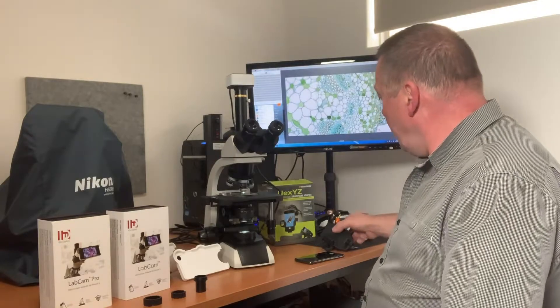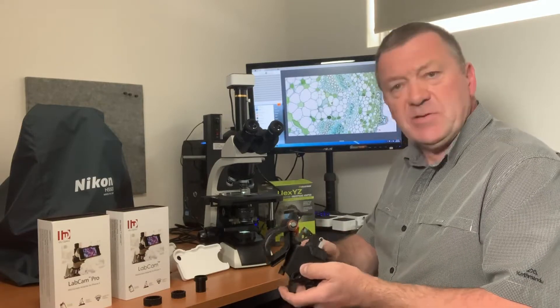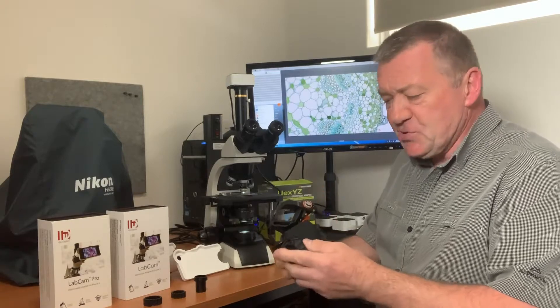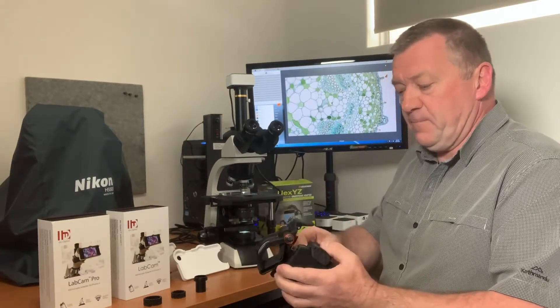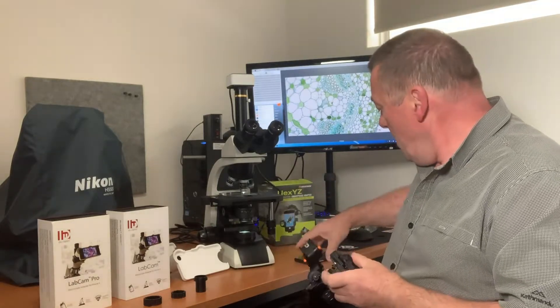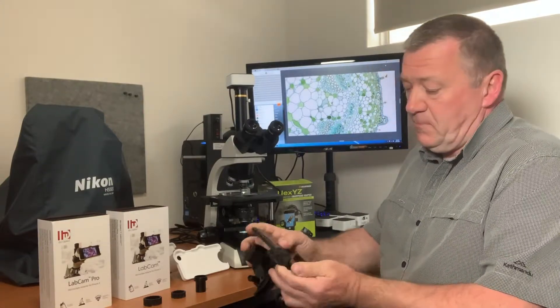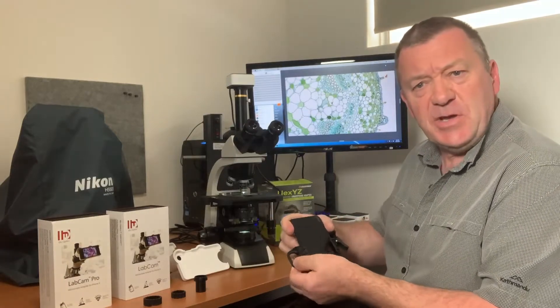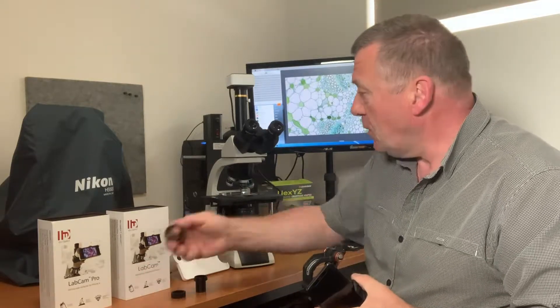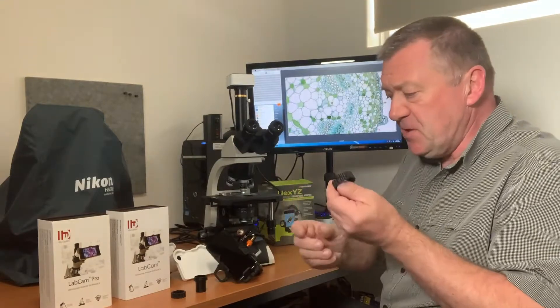I'm going to start with the Celestron adapter. When I first got it out of the box, I thought it looked quite complicated to use — a bit over-engineered, with a lot of adjustments. I fitted my phone to the adapter; it's a universal adapter so you can fit any phone to it.